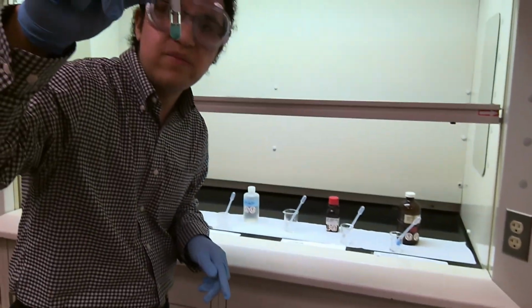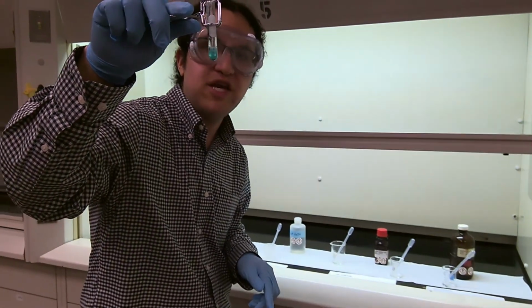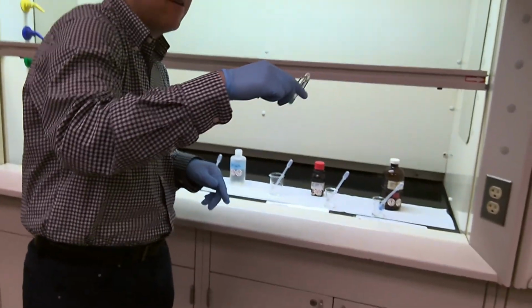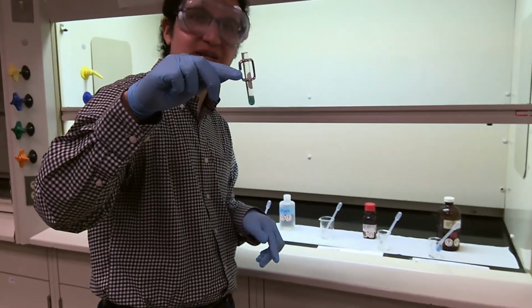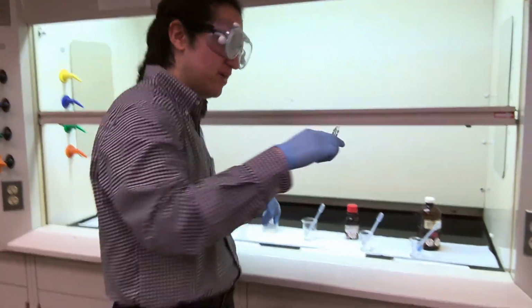So notice how it's bubbling and fizzing during this process, and we're undergoing another color change to generate our good old friend copper sulfate, which is the deep blue solution that you've been handling throughout your laboratory experience.